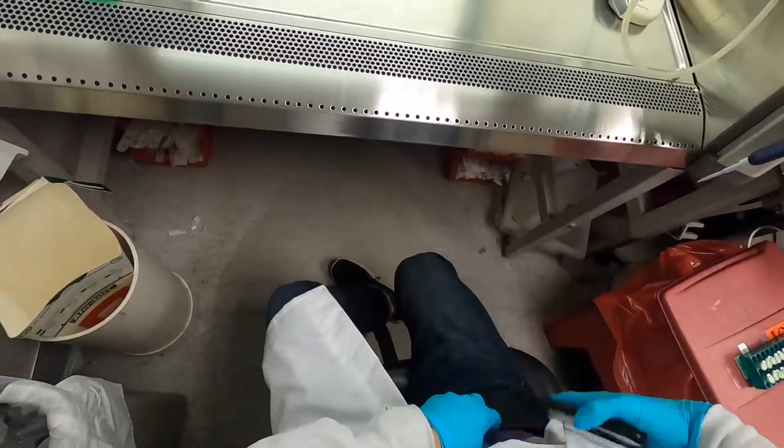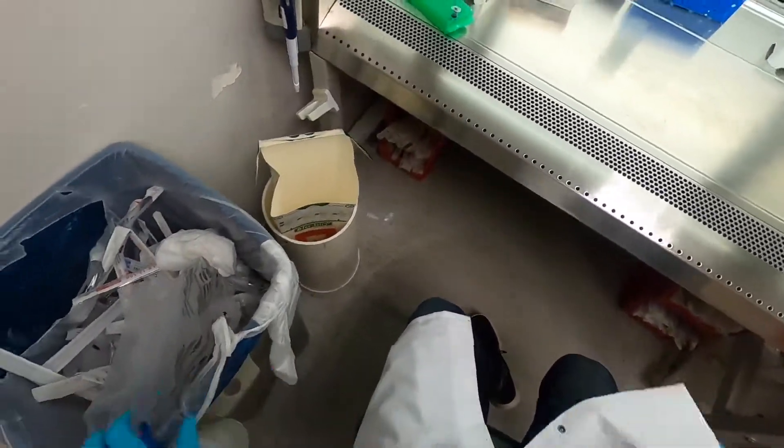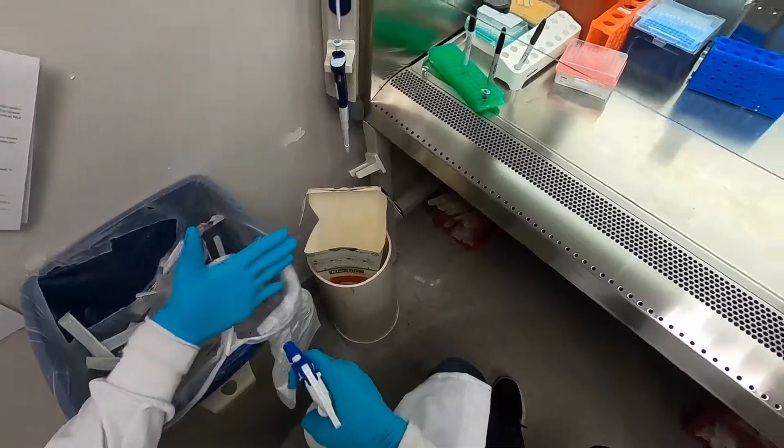Hi everyone, it's Andrew, and today I'm going to be teaching you how to do a transfection of mammalian cells.